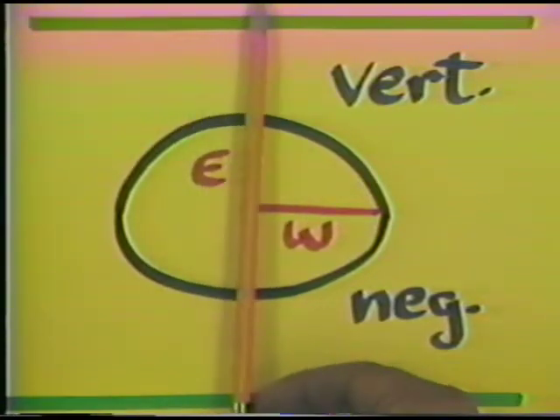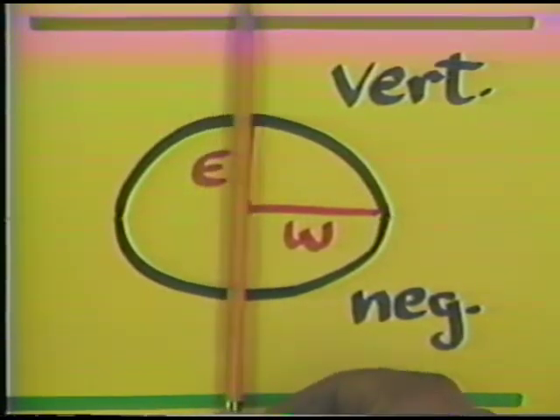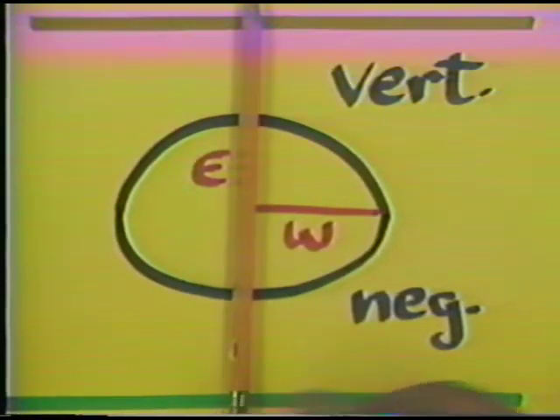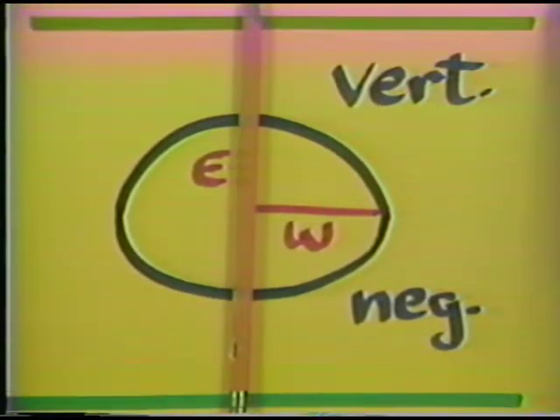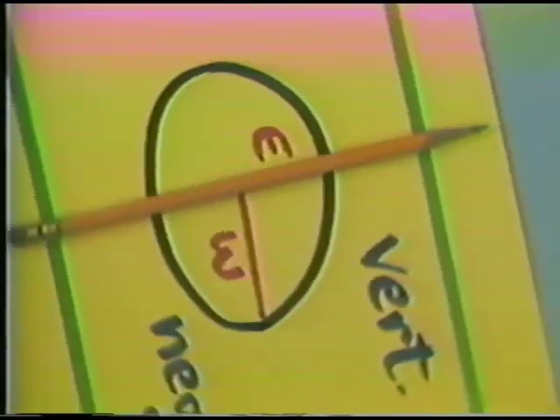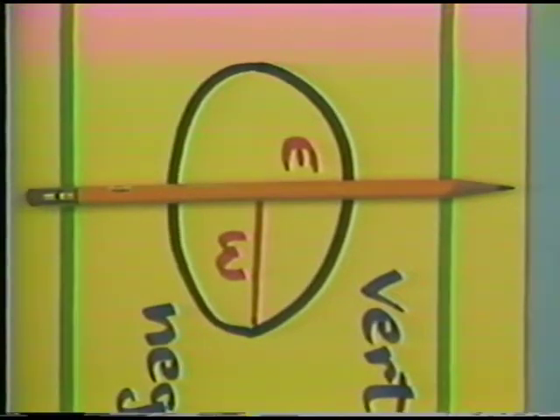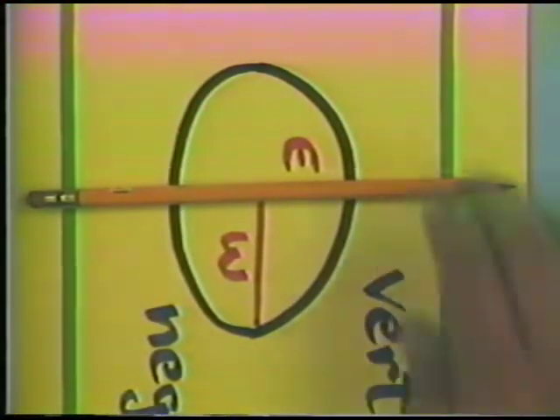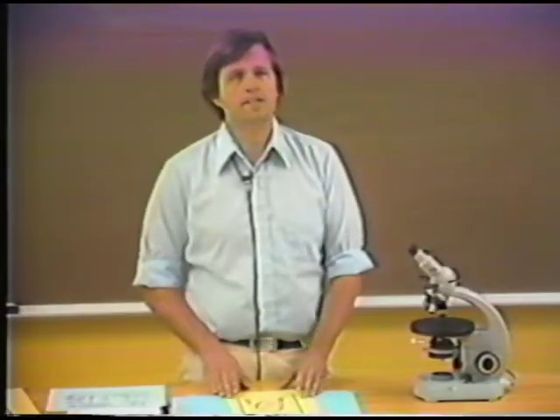And again, to examine epsilon, what you need to do is rotate the mineral grain until the E-ray, or the E vibration direction, is parallel to the microscope polarizer. Or if you had this mineral grain and you knew its orientation, then you would have to rotate the mineral until the E-ray was in an east-west position parallel to the microscope polarizer.